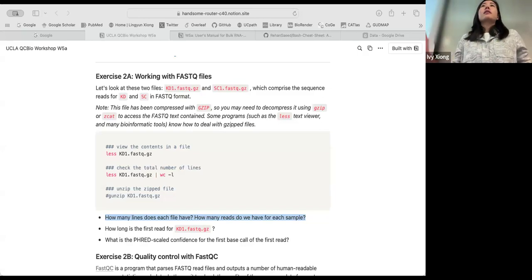Oh, so you can create aliases that customize things. So S for me is less with the long view. It's just because I use that a lot. Instead of typing five letters, I can type one for all. You can create aliases as you like. Let's say you want to find out what you typed before. Instead of the whole word history, you can just say H for history, things like that.